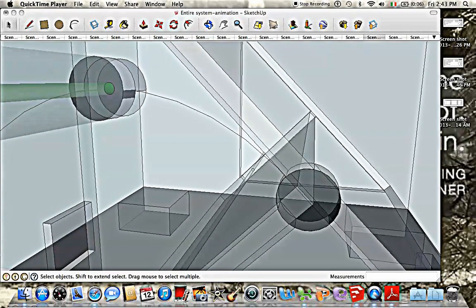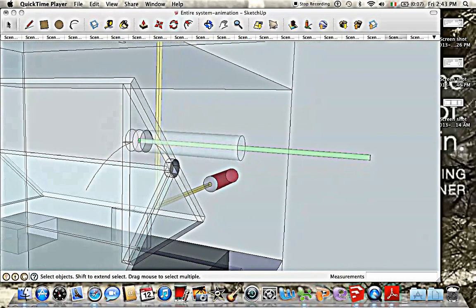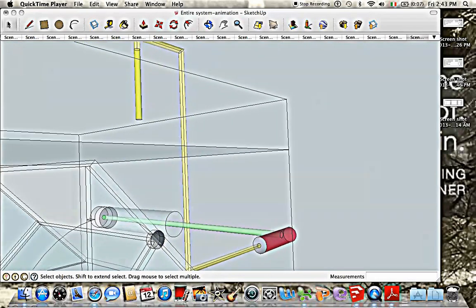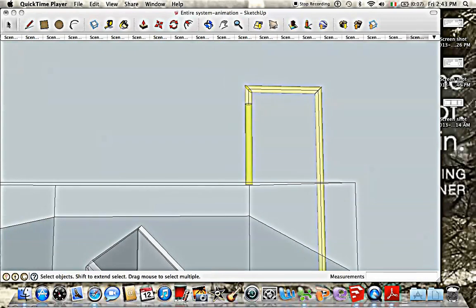and will pass a copper wire generating a current. This current passes down the green wire as seen and to a computer. Each time the bucket tips, the computer will record it. As can be seen, the wire is not submerged in the water for obvious reasons and is covered at all times by a plastic tube.